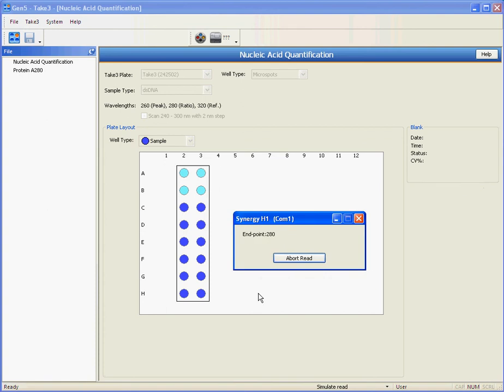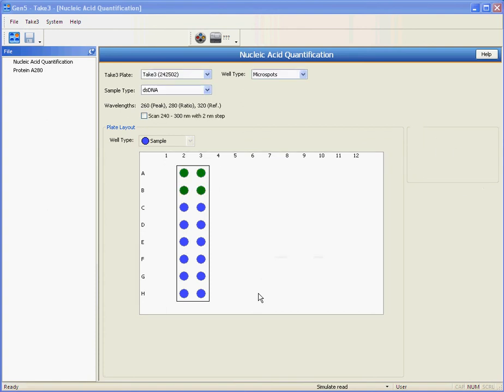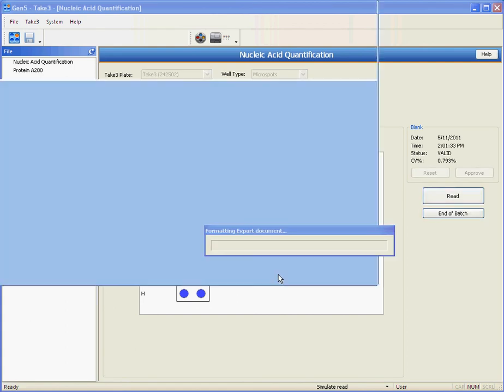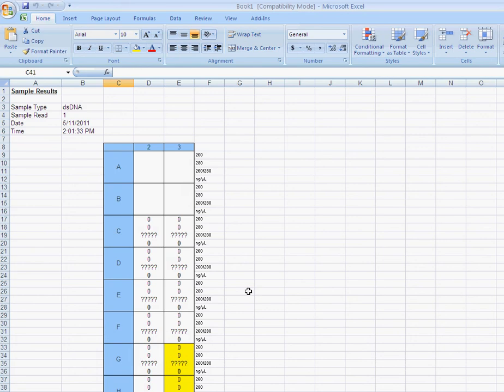The blanks are going to be measured along with the samples on the first slide, and all you have to do is approve your blanks and everything is exported to Excel—blanks and sample results.